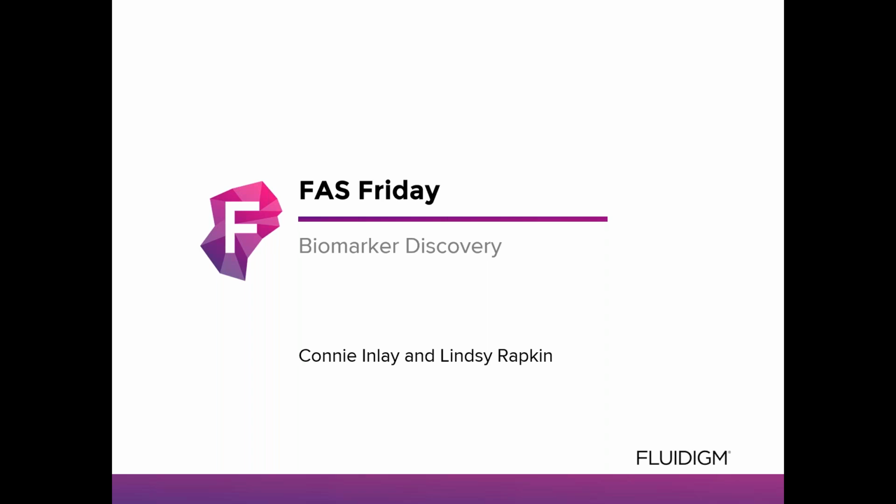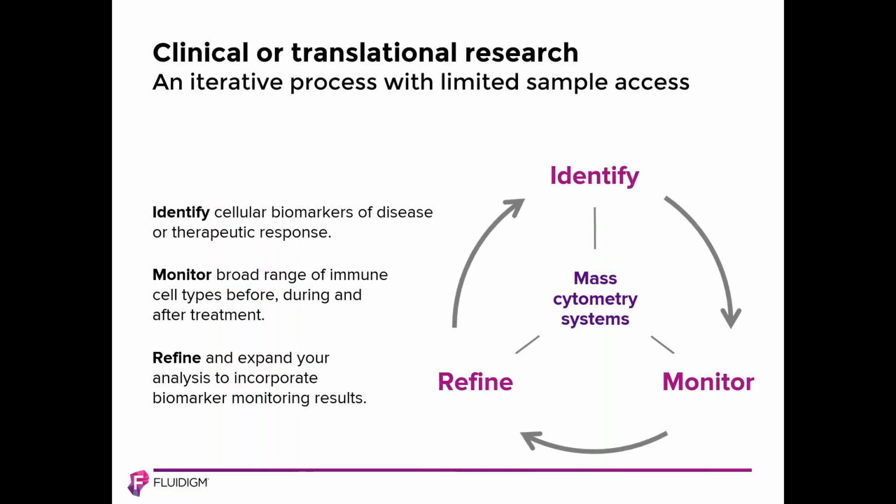First, I'd like to discuss how the use of mass cytometry and imaging mass cytometry enable biomarker discovery. Clinical and translational research is often an iterative process with limited sample access. This means getting the most information possible from each precious sample.